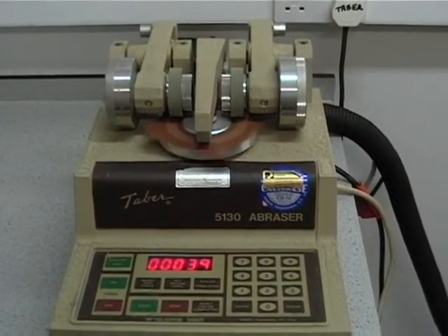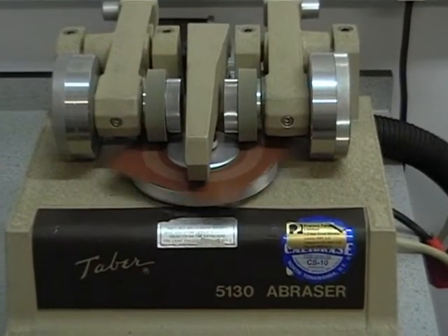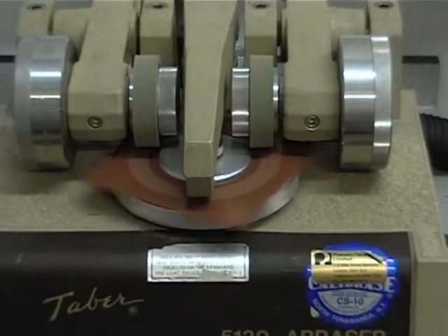EN 13523 Part 16, commonly known as the Taber abrasion test, is used to determine resistance to abrasion for pre-painted metal.